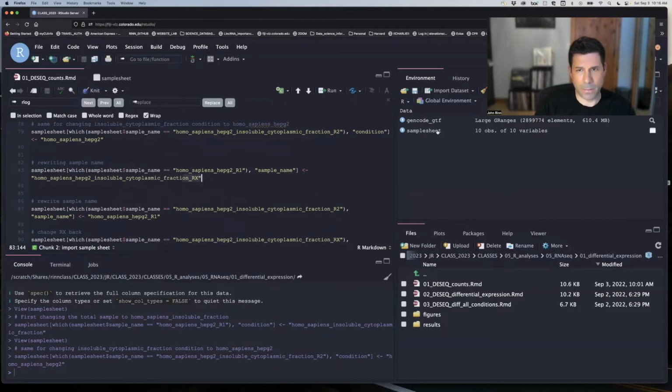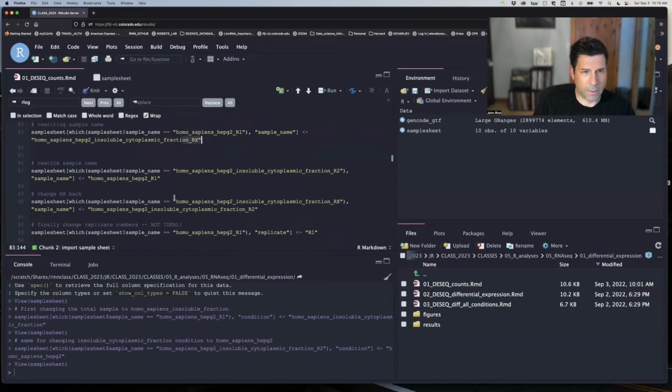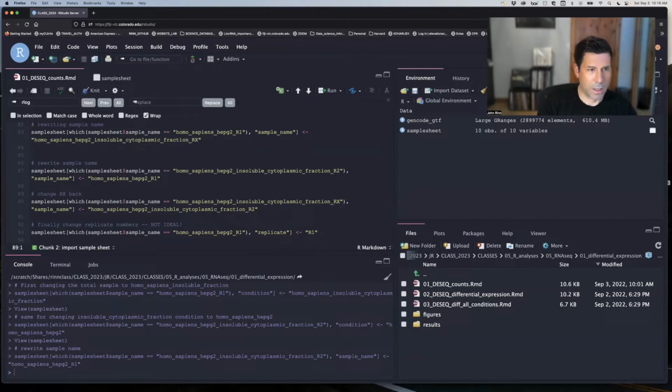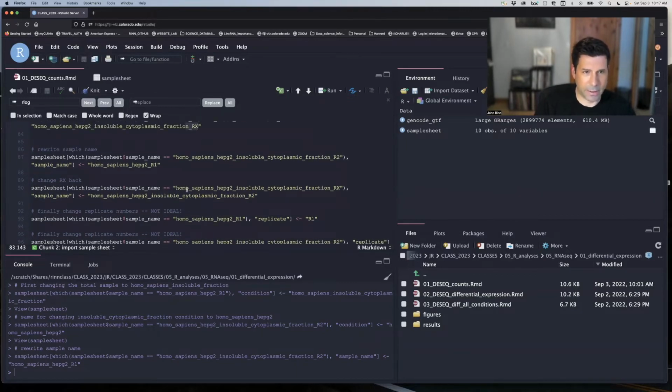replicate number, because we can see once we've made these changes, this is going to be replicate 2 and not replicate 1. And so we need to rewrite the sample name here, and you can watch those change. And then we're making this replicate X here, so we don't rewrite over the name when we change it again. So we'll have 2 names at some point that are the same. And if we select on that name, it's going to change both of them. Again, think of this as a good practice in indexing and tracking samples and being pretty careful about it.